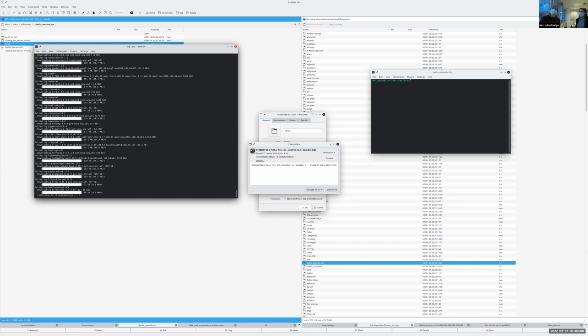Okay, now it's downloading all the dependencies, because without the full in brackets, which I forgot to put at the beginning, it doesn't download all the dependencies needed, and that's why it crashes. When you installed Darfix, did you put the full? I did. But since it was out of an environment, they might have collapsed with something. But it's really weird because it seems like the same problem that they have in Windows. Yeah, but I think the ebooks are just having trouble with everything.